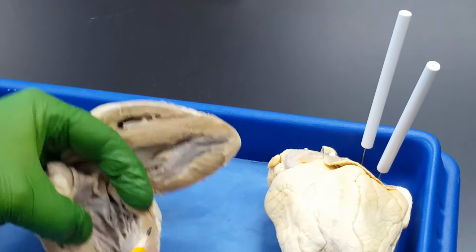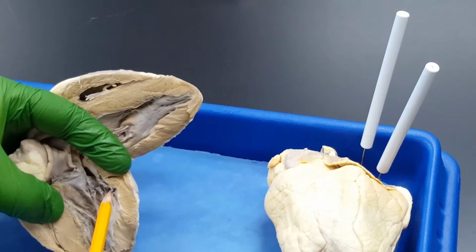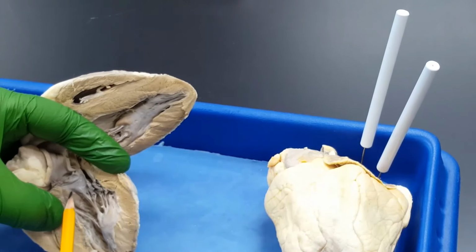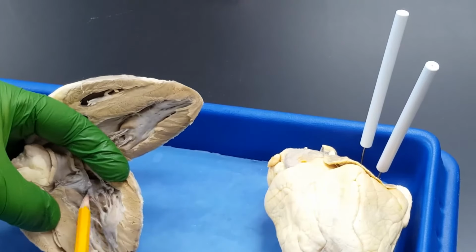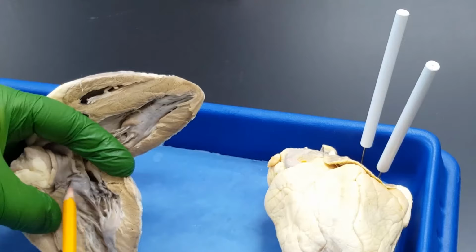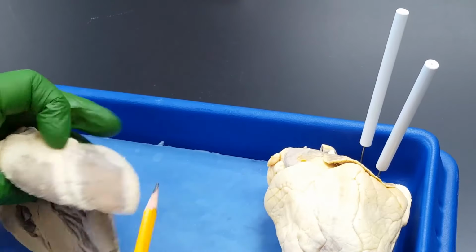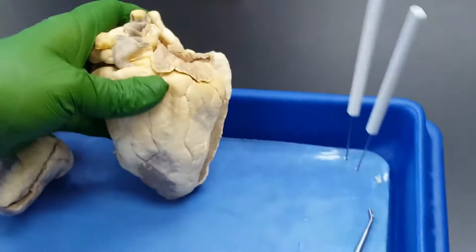Now notice it's right next door to the mitral valve. So look over here, see this that I'm pushing with my pencil? No cords here. Cords over here on these flaps. So they're continuous pieces of connective tissue, but no cords over here. Aortic semilunar valve. Let's look at the other heart, a little bigger.